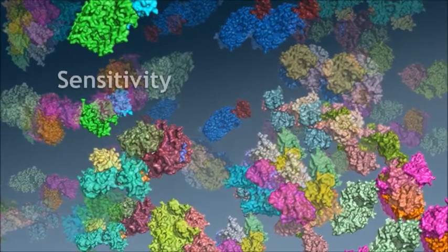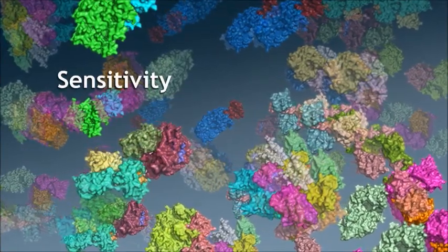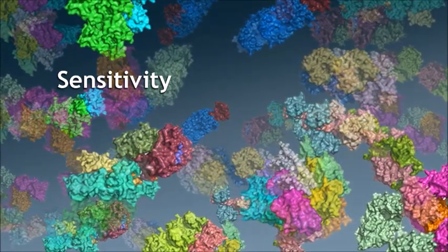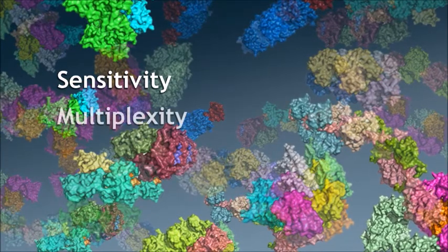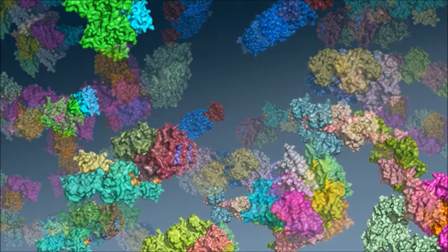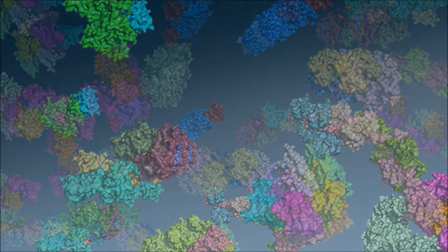First, sensitivity. We need to count free single-molecule proteins and protein complexes. This will be possible if we can amplify single-molecule signals. Second, multiplexity. To analyze many, for example, thousands of different proteins at once, we need to identify each of them in a single mixture. Third, in situ detection. By this we mean we need a way to see which proteins actually form complexes. At the GU Lab, we will develop an in situ protein interaction sequencing technology to solve these problems. Let's take a closer look at the technology.